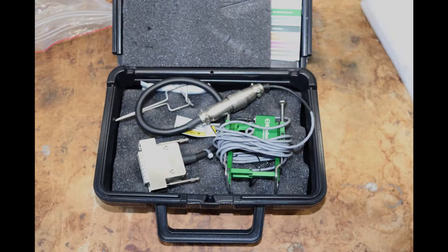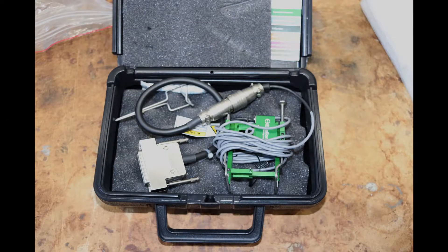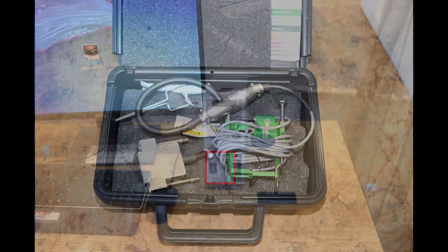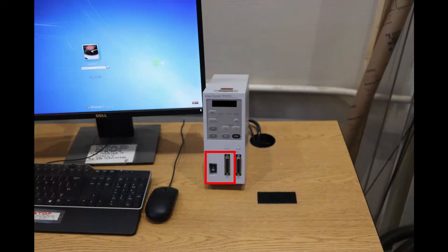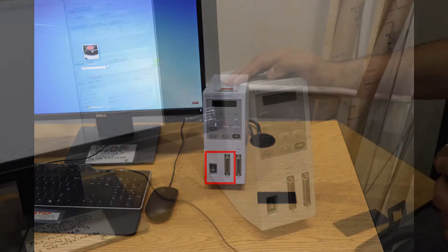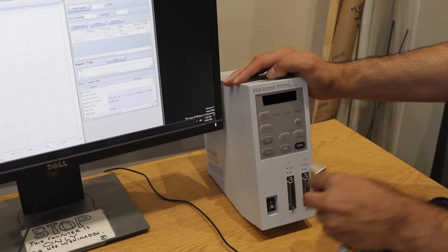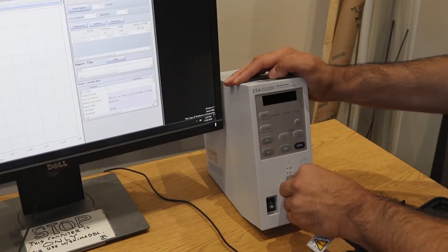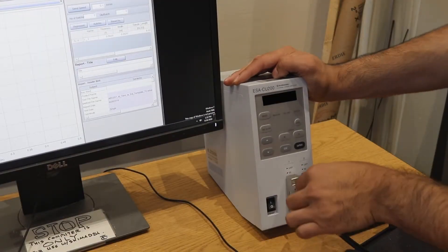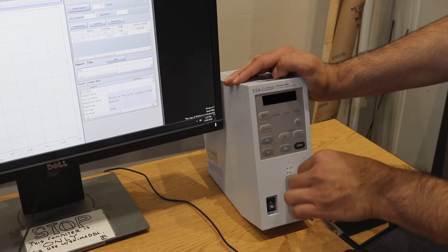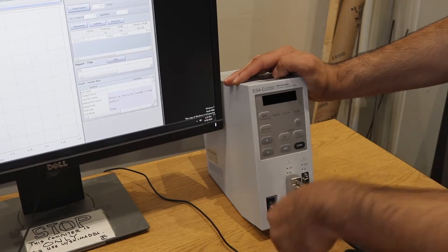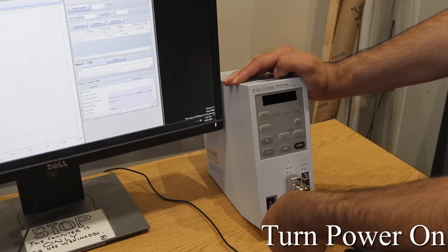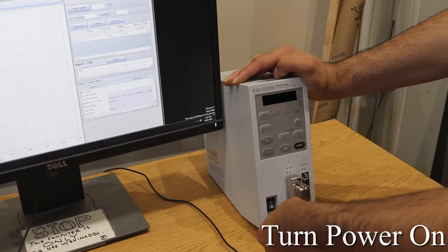Now we locate the extensometer and connect it. These are the ports we will be using on the extensometer measurement device. The pinned connection only needs to be screwed lightly in place. Now we turn the power on to the extensometer.